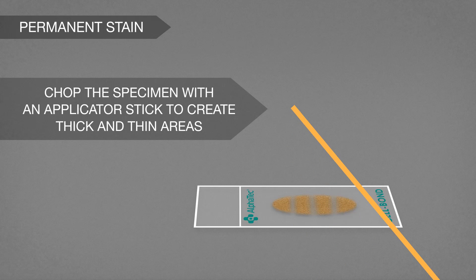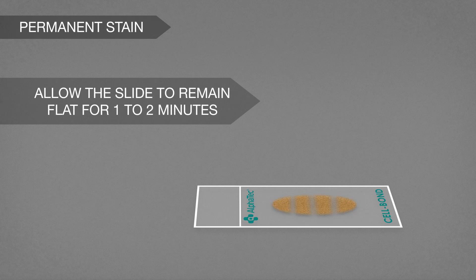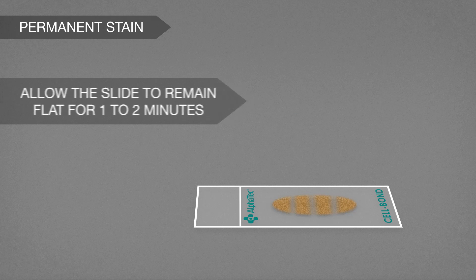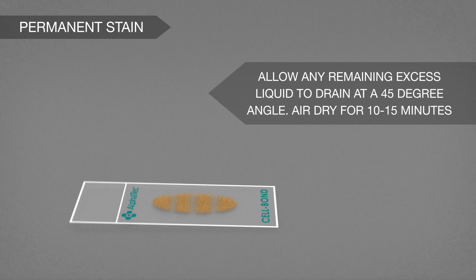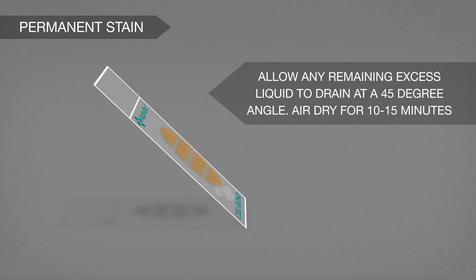Allow the slide to remain flat for one to two minutes. Allow any remaining excess liquid to drain at a 45 degree angle. Air dry for 10 to 15 minutes.